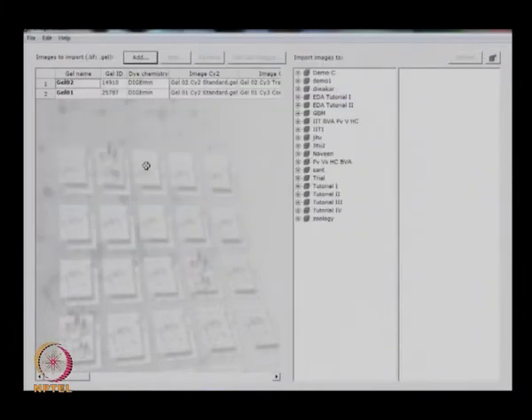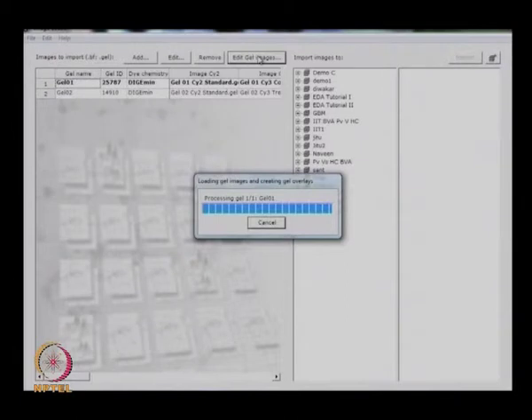and once you have uploaded, you can edit these gels right here, like if you want to crop or edit anything, any sort of thing you can do here. It will allow you to edit these images. So now you can see this is the overlay of 3 images.